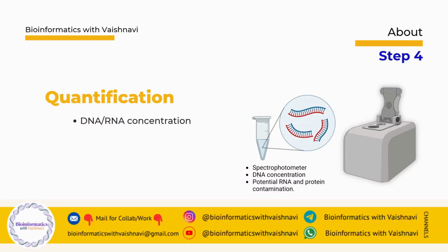Moving forward to quantification, next we measure how much DNA or RNA is present in the sample. This step is called quantification. Quantification is important because too little DNA gives poor sequencing results, and too much DNA can also cause issues. Accurate concentration is critical before moving forward, and this is done by a spectrophotometer.